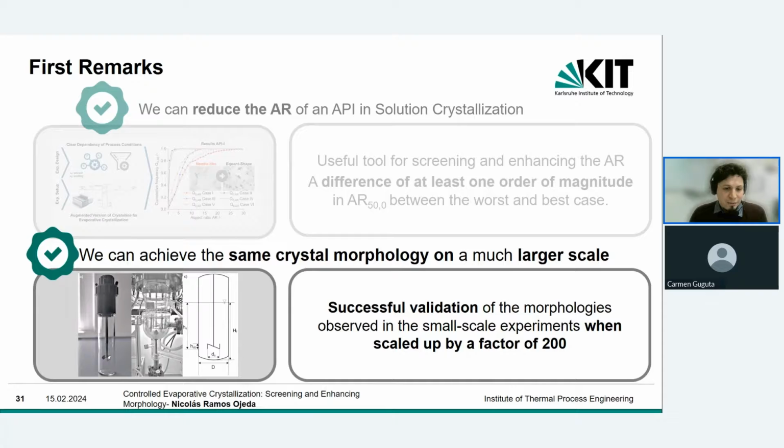And finally, I think the key take-home message from this second part is that, for sure, we provide more certainty that experiments from miniaturized crystallizers are to a large extent consistent with the outcomes on large scales.